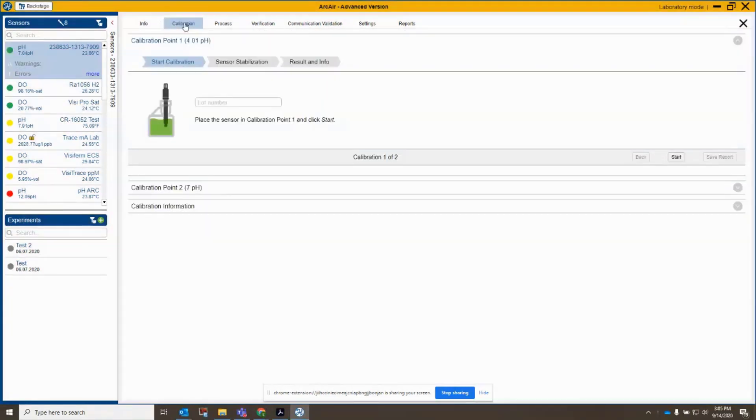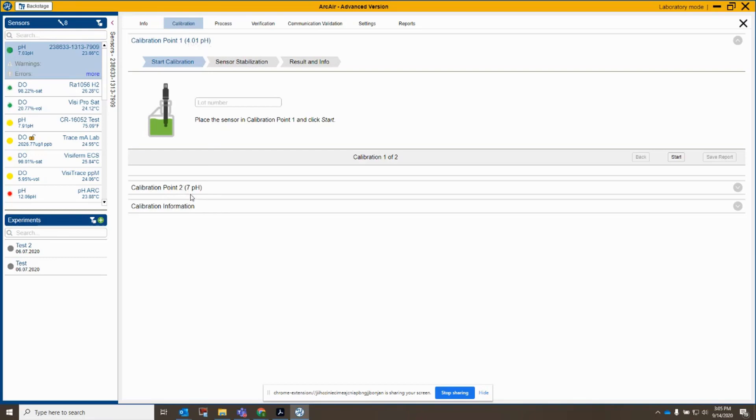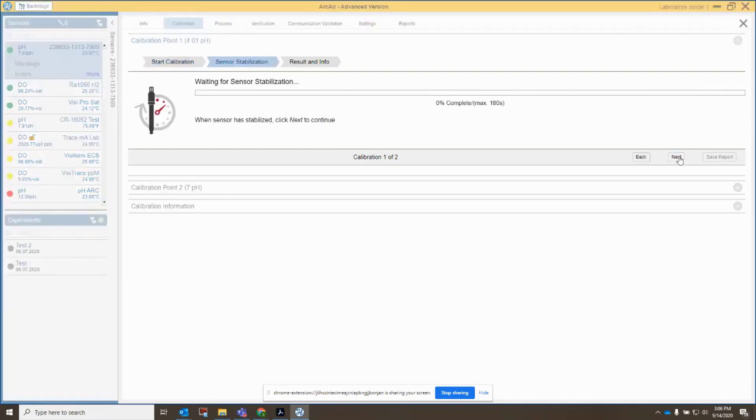So the first thing I notice when I go to calibration is I see that I have a calibration point 1, 4.01, and calibration point 2, 7 pH. So since my sensor is sitting in 7 buffer, let's see if we start there what happens. So I'm going to punch in just a mock lot number here, and let's start here.